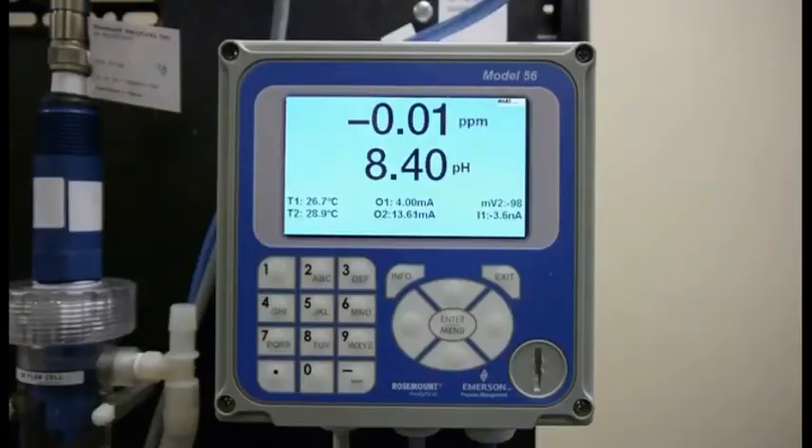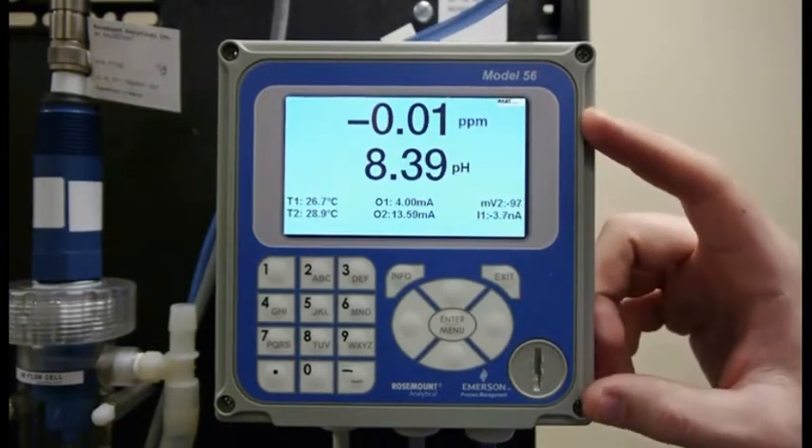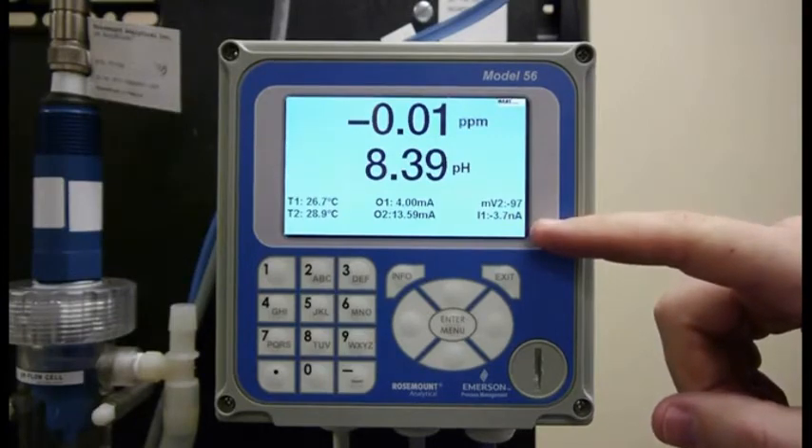The thing to remember when you're zeroing the sensor is not to look at the parts per million. What you need to look at are the zero nanoamps. That's down here in the bottom right corner on this Model 56.